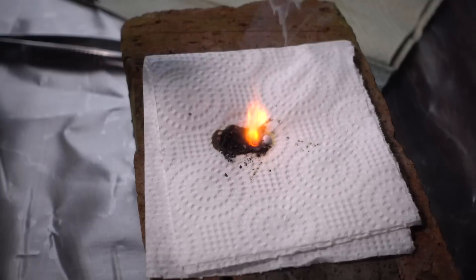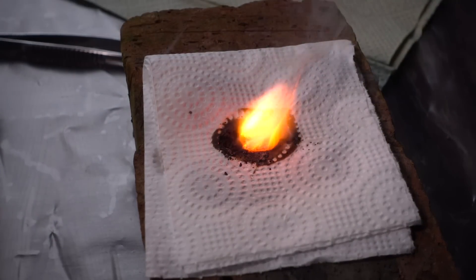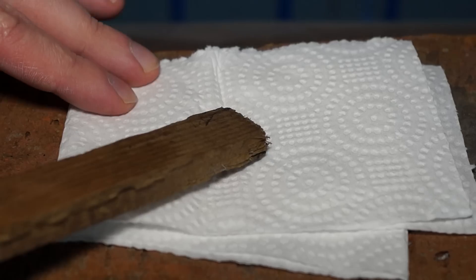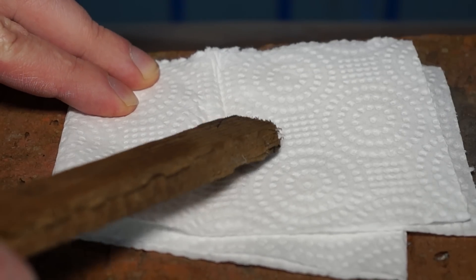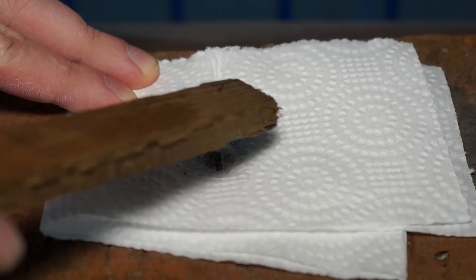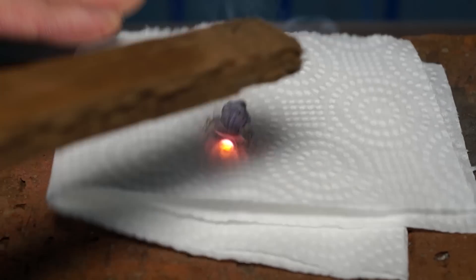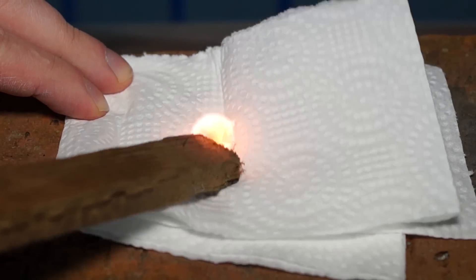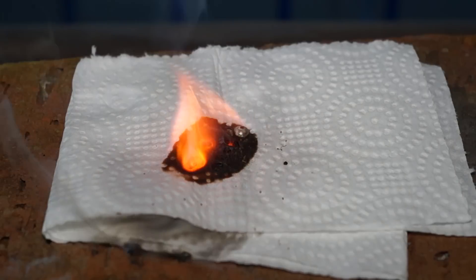Thus potassium superoxide and potassium peroxide are formed. Also, for this reaction, the napkin is involved. Because of its higher activity, the potassium can pull oxygen from the cellulose molecules that napkins are made of.